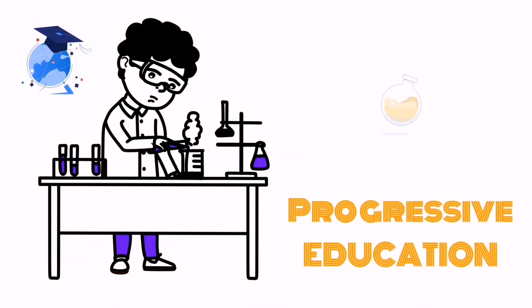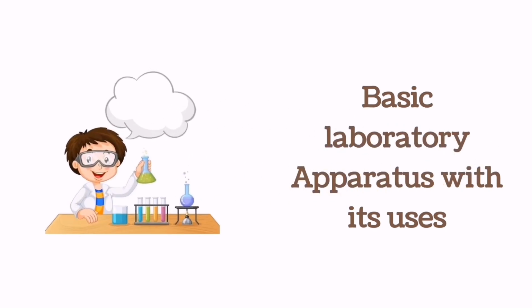Today I'm going to discuss basic lab equipment. In this video we will learn about basic apparatus used in the laboratory.